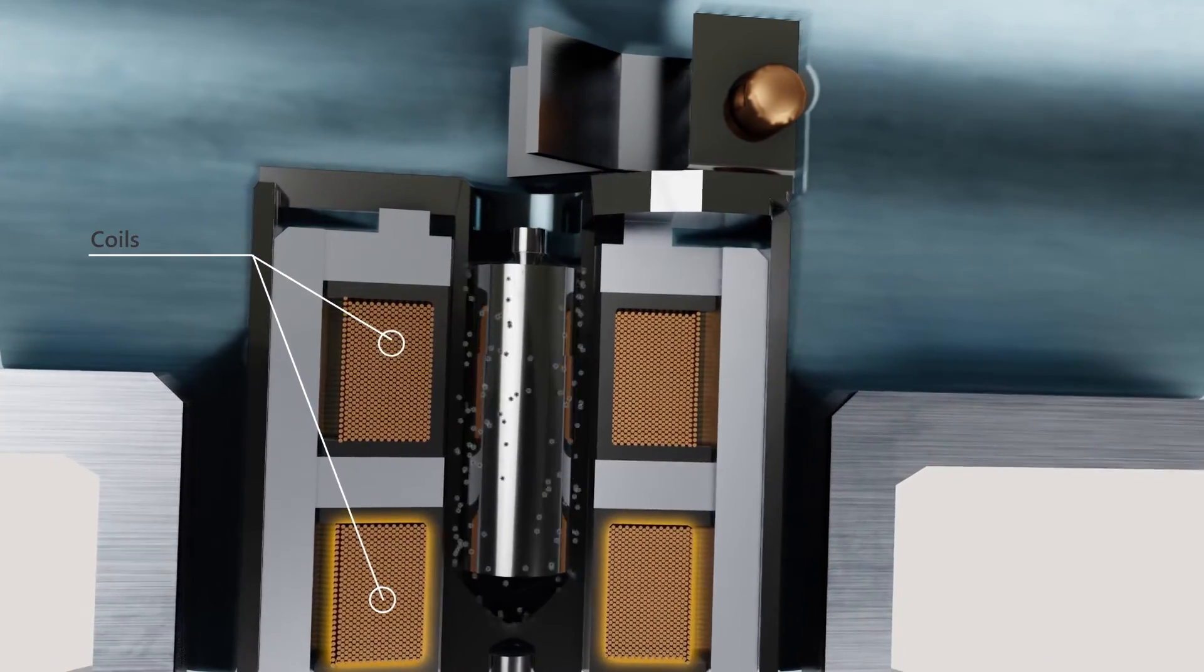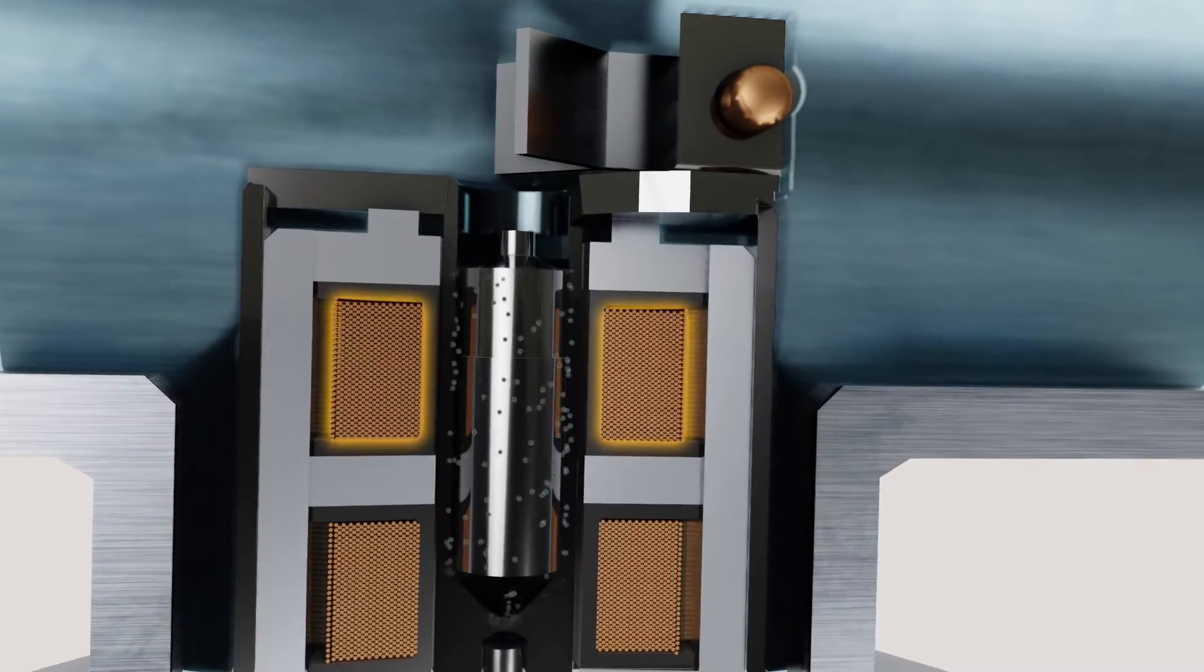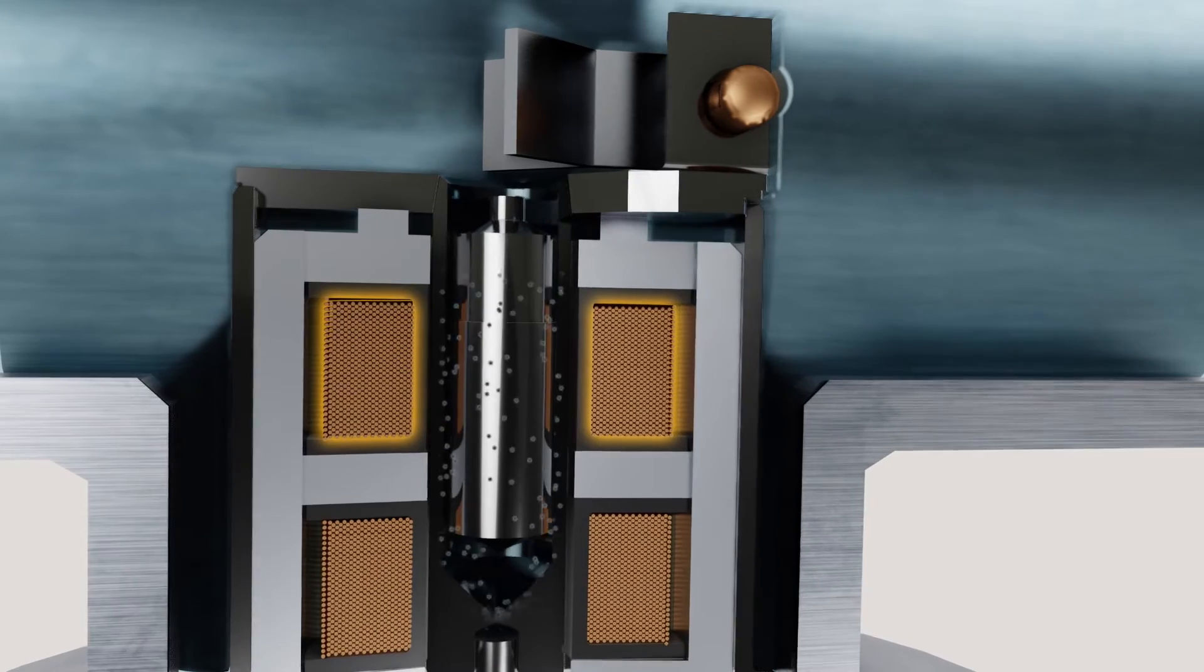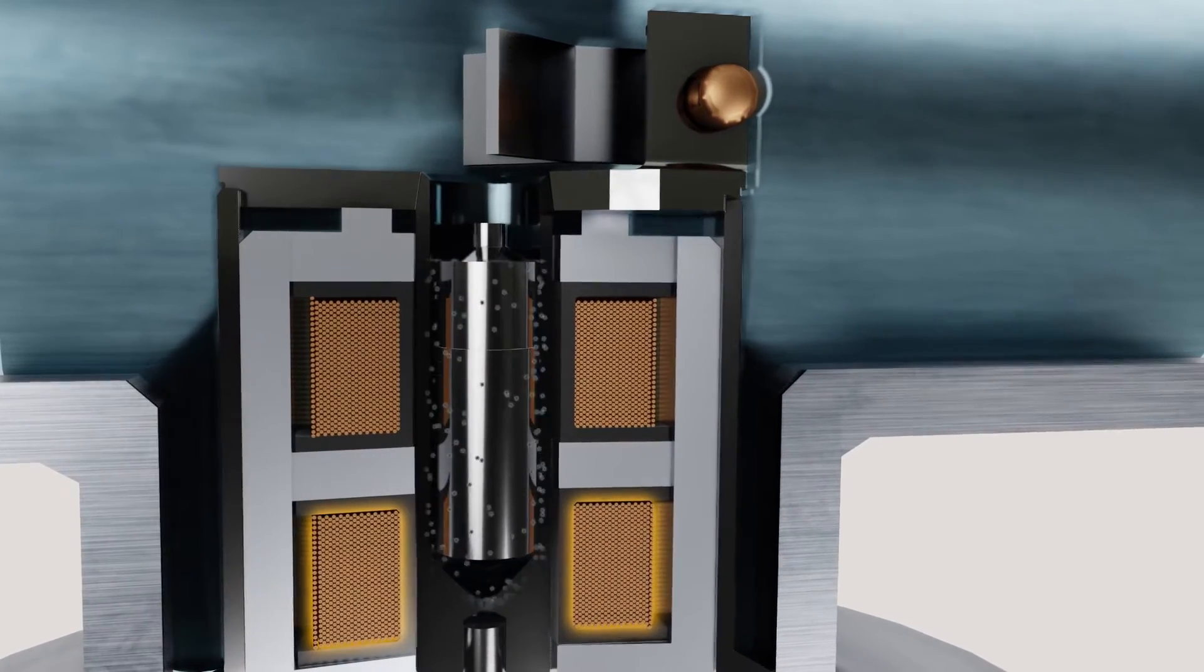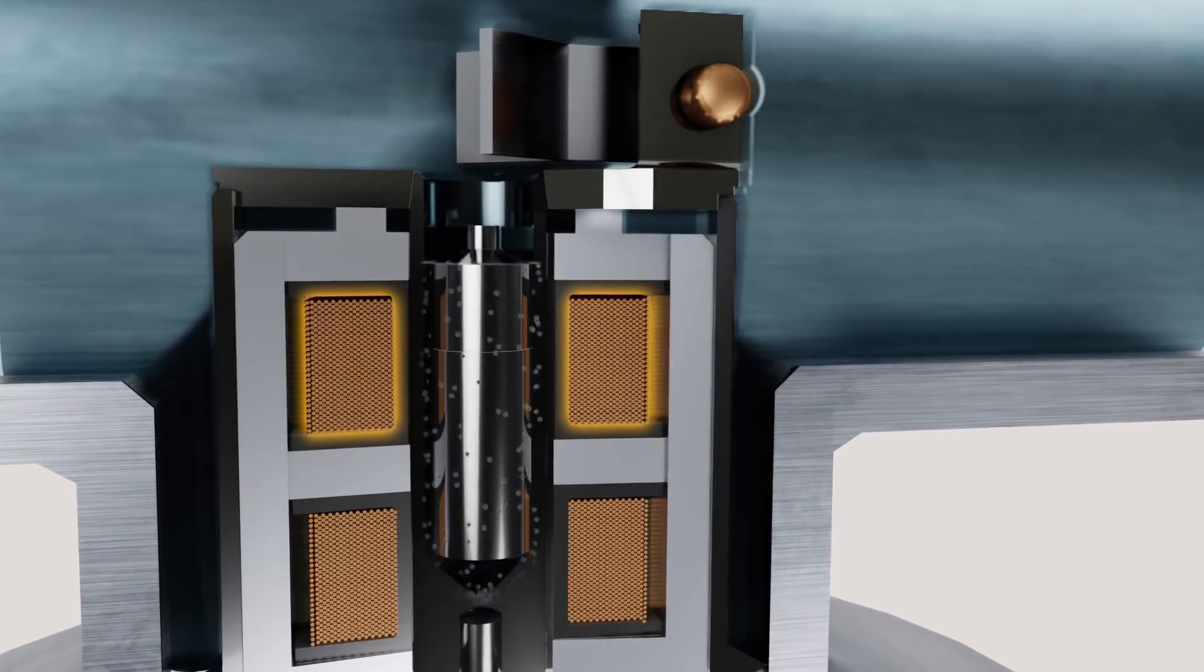Proprietary circuitry analyzes the piston two-way travel time to measure absolute viscosity.